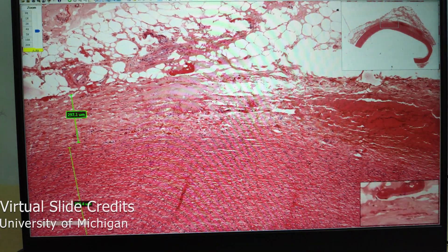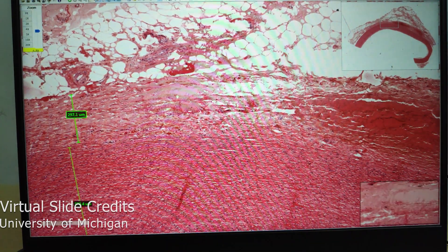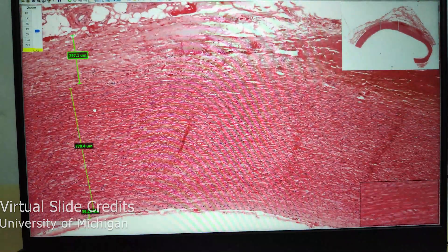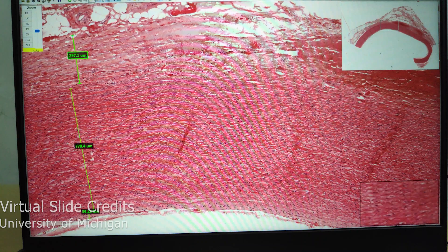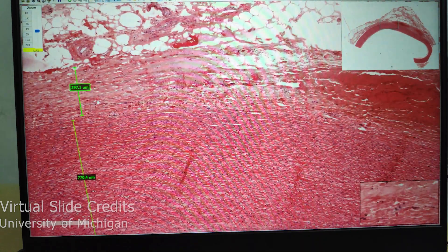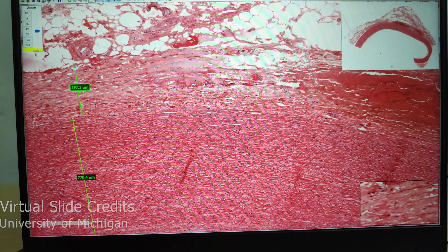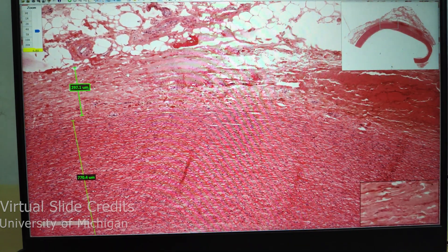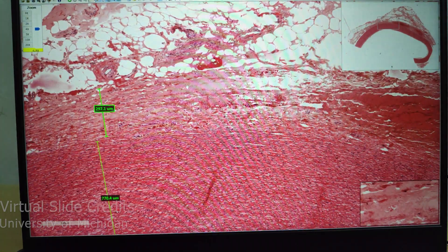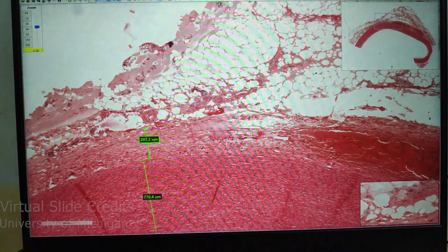Coming to the adventitia, it is much thinner compared to the media. There are no prominent features — you only have connective tissue, which blends with the connective tissue surrounding the blood vessel.